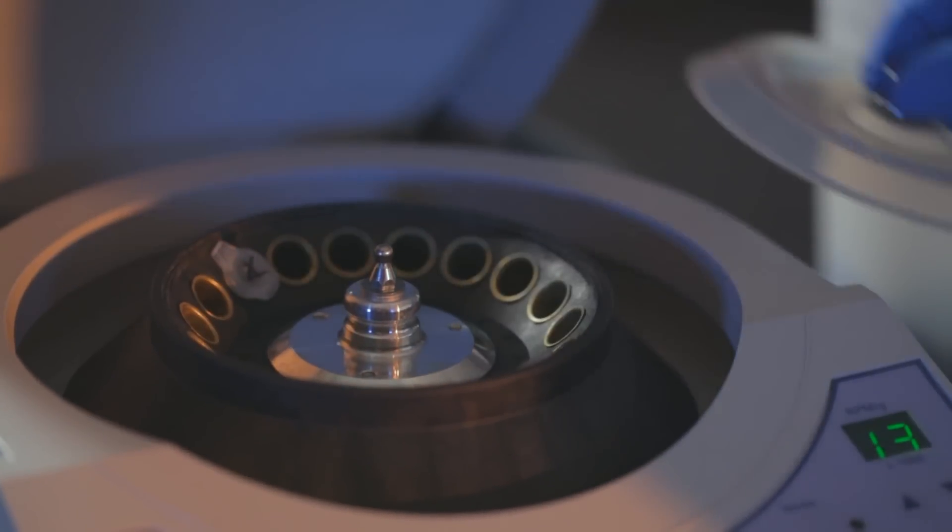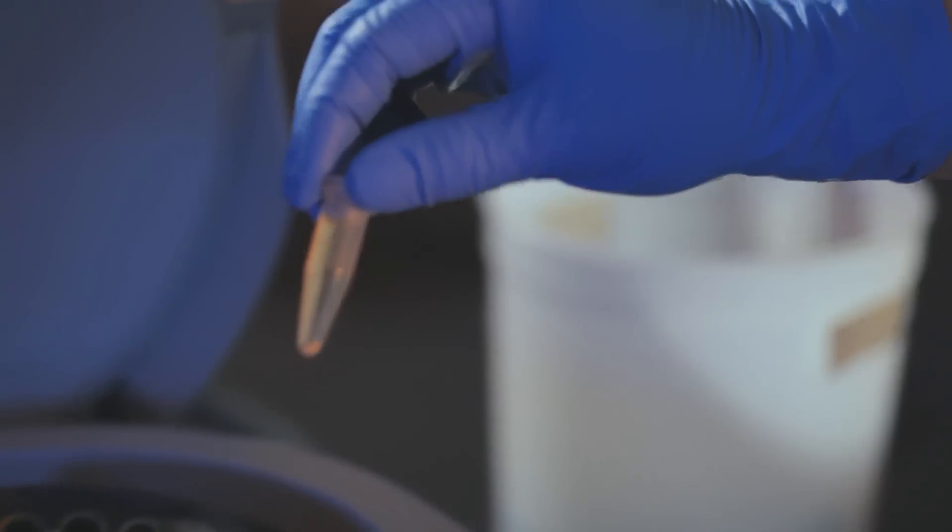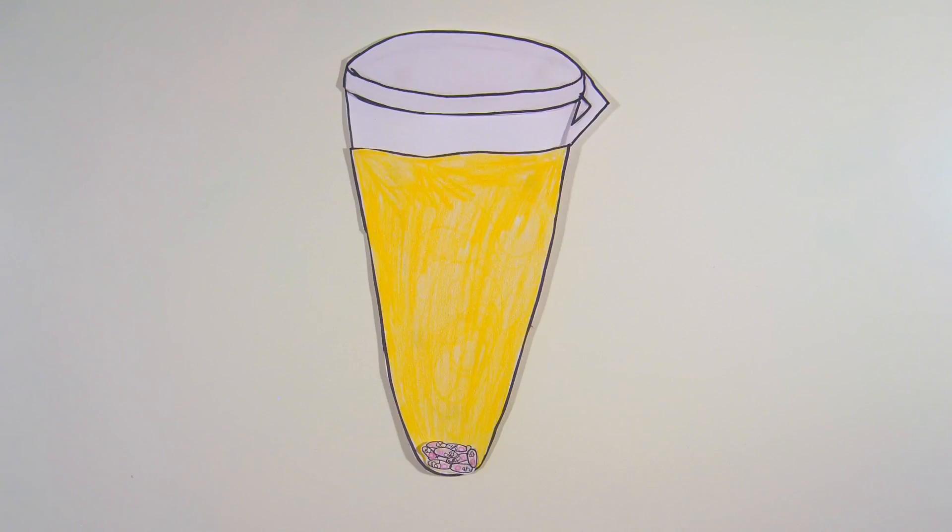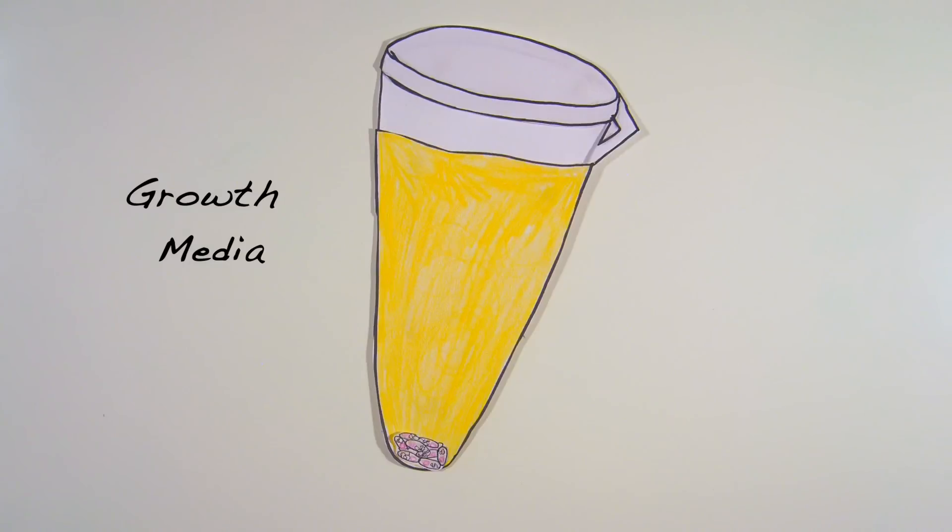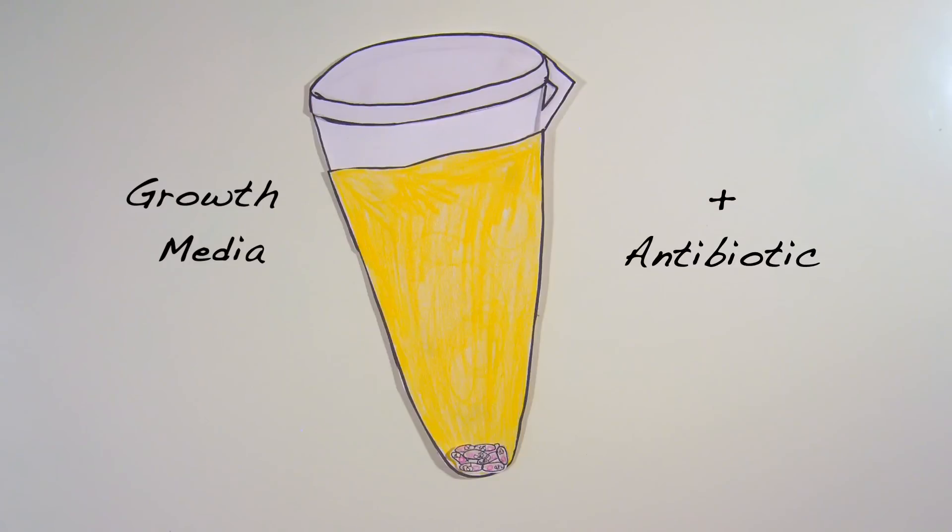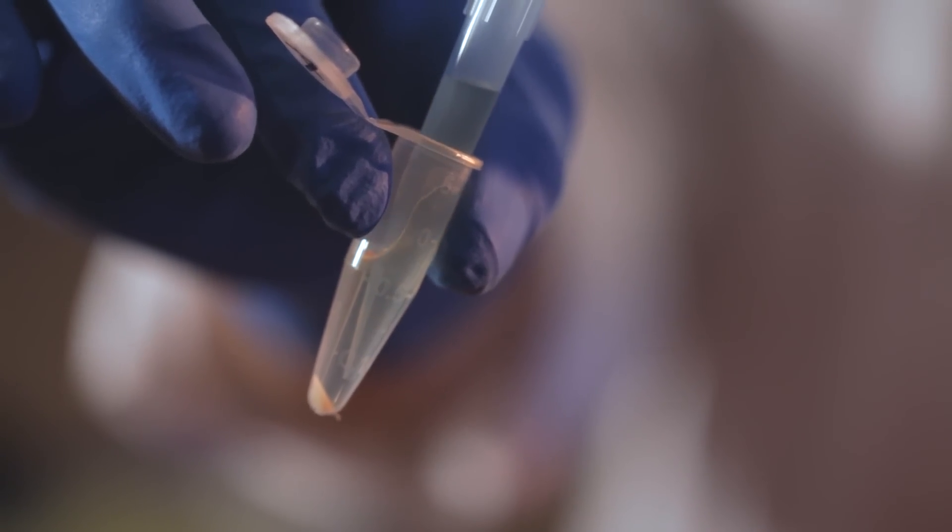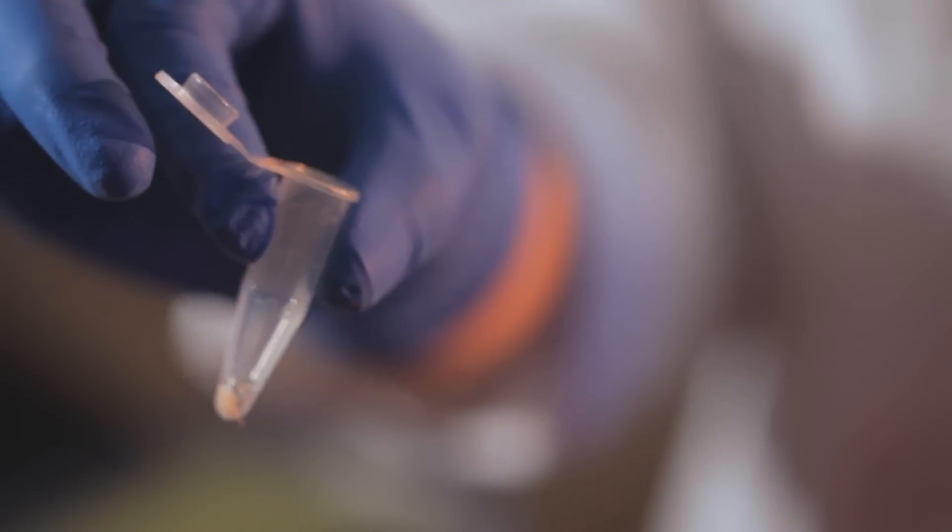At the end of the centrifugation, a small pellet will be at the bottom of the tube. This is made up of the bacterial cells that contain the plasmid DNA you want. The clear liquid supernatant is LB, the bacterial growth media, with an antibiotic such as ampicillin. Remove all traces of growth medium by pipetting or pouring out and discarding the supernatant. Don't worry, the pellet will not move as long as you don't touch it.